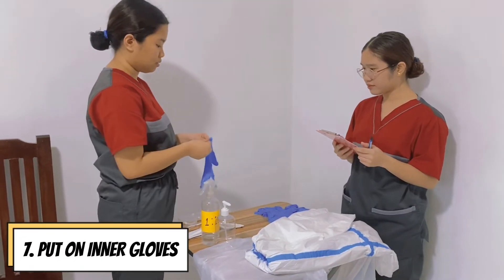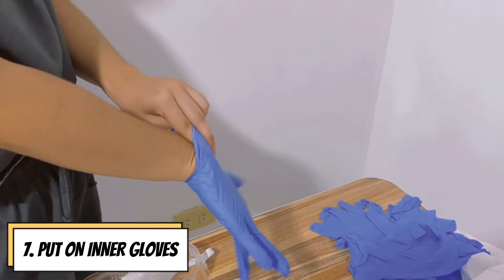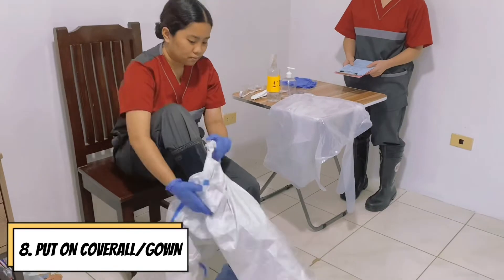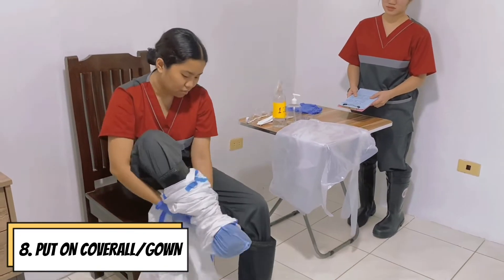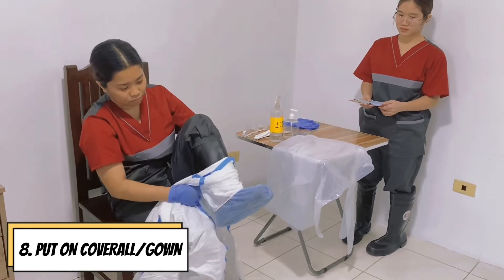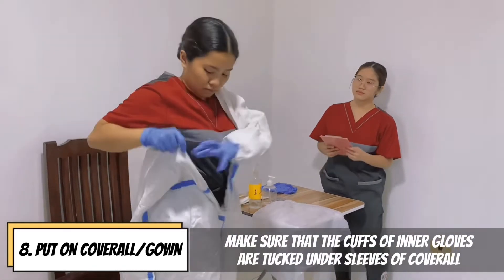Put on inner gloves. Put on the coverall or the gown and make sure that it is large enough for free movement. Make sure that the cuffs of the inner gloves are tucked under the sleeves of the coverall.